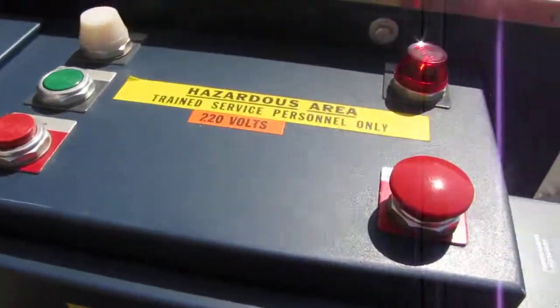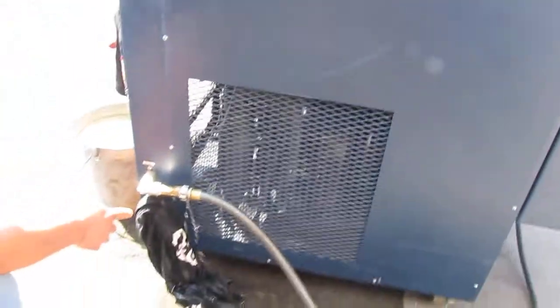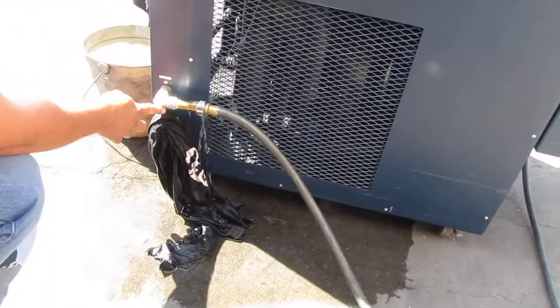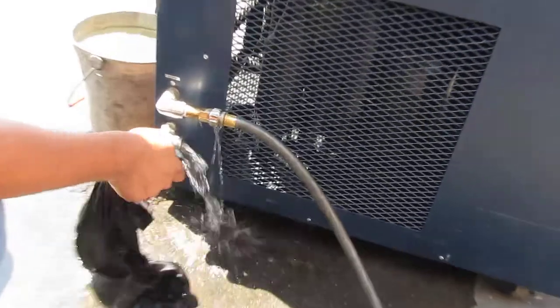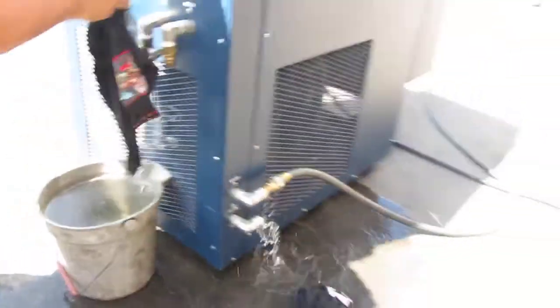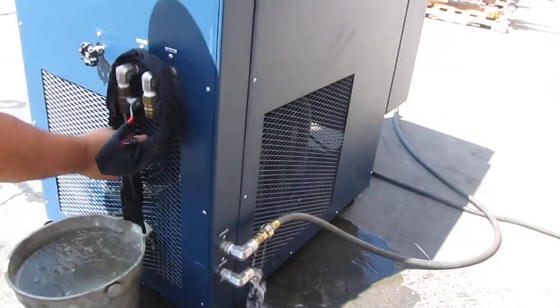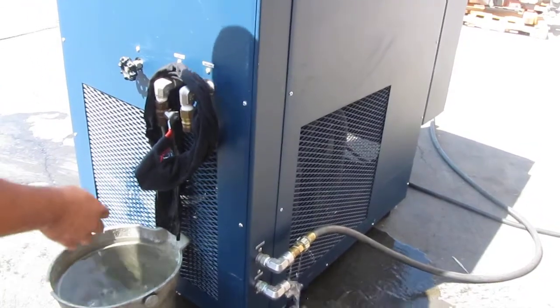We also have the water hooked up. This is where you hook up your tap water right here, and then it comes out of this water right here. Right over here is where the cold water is coming out of. We got a rag in here because it'll keep it from pointing at the machine.